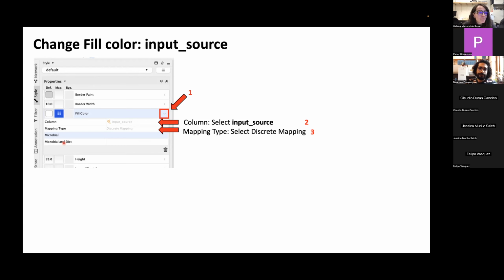Sorry, can I ask a related question? So, Peter, you said that you check metabolites that are being produced here in this case. Do you also have the information of metabolites that are being consumed by the bacteria? So we do capture that information in the knowledge base. In principle, it should be a part of the file that's incorporated into the Cytoscape file.